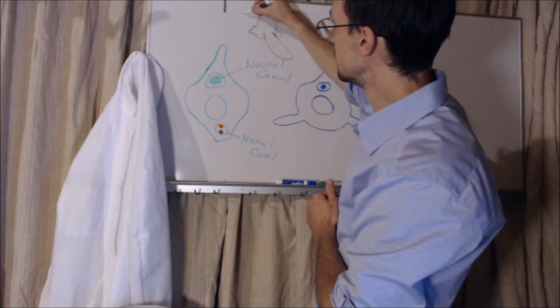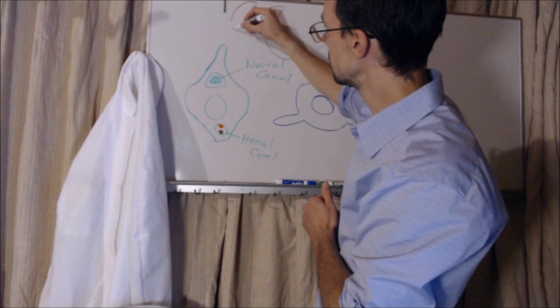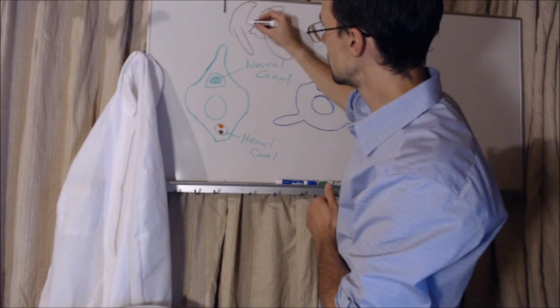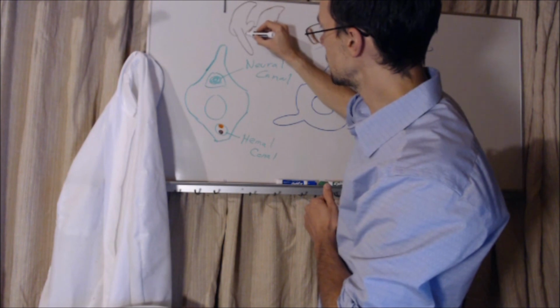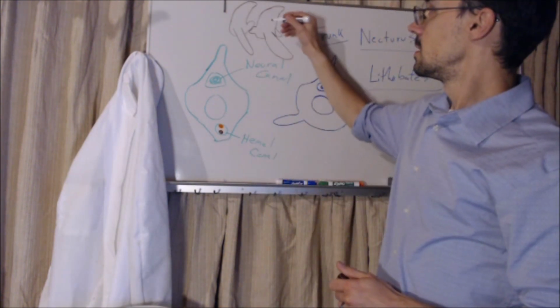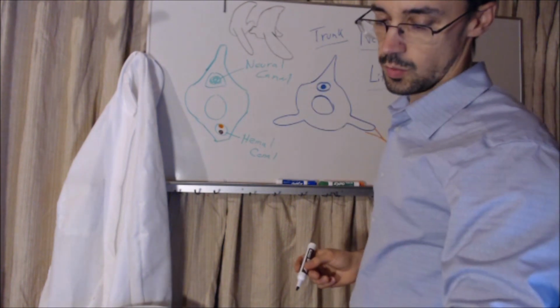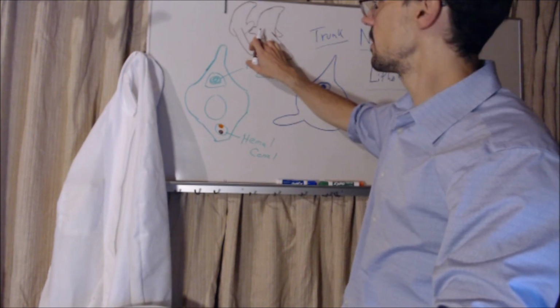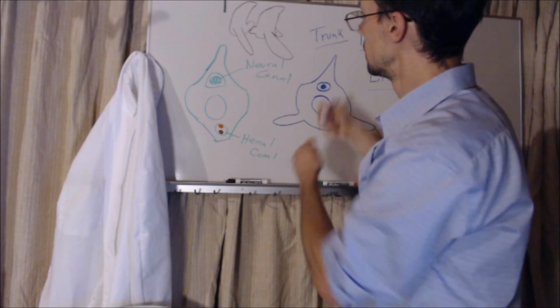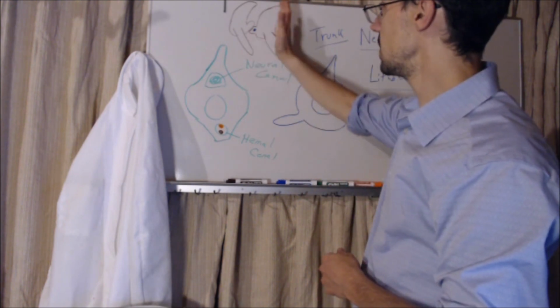Such that if I look at the next vertebra, transverse process, centrum, I would see that process on this one line up with the process on the one posterior to it. So here, these are my zygapophyseal processes. And the one that comes in the very front of the vertebra, let me specify that one with a blue dot. That's my pre-zygapophysis because it's the first one on that vertebra.